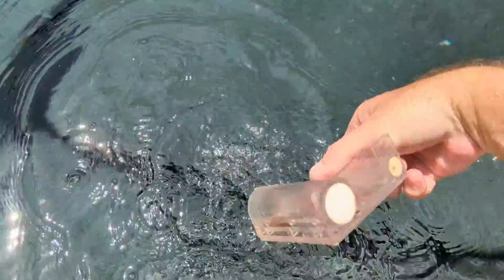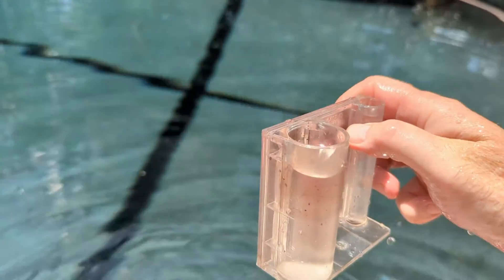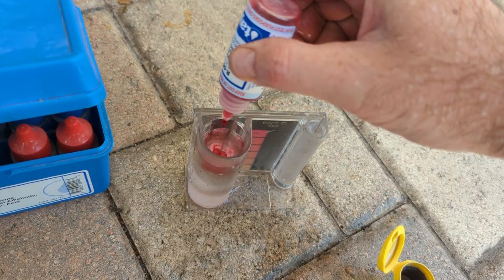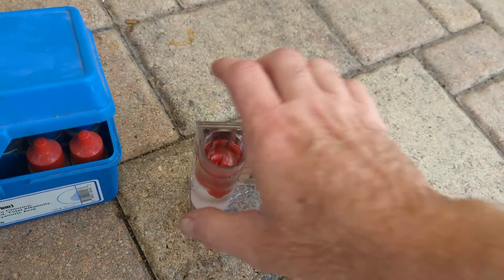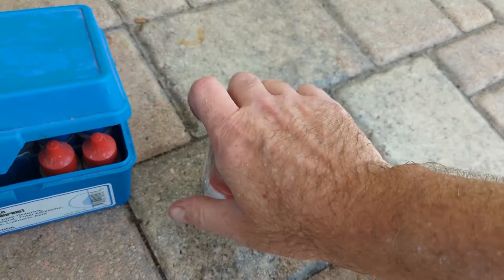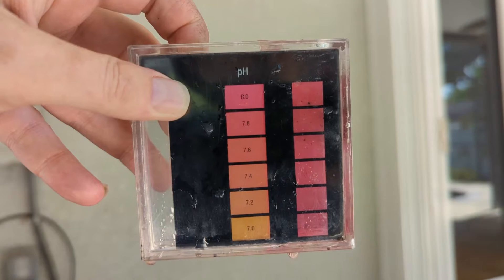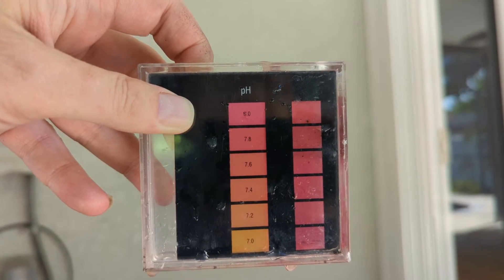Next we're going to do the pH. I'm filling this whole thing — just so you know I'm not cheating at all. Five drops of reagent. Now, do as I say, not as I do, because I lost my lid — don't do this, always put a lid on. Then we look at that and match the pH up with the color chart. It's pretty high — I would say about 8.0.